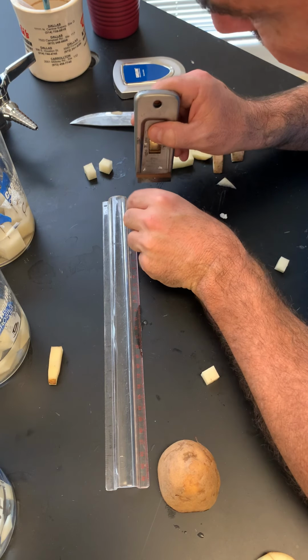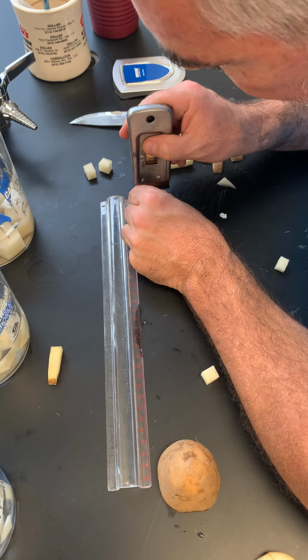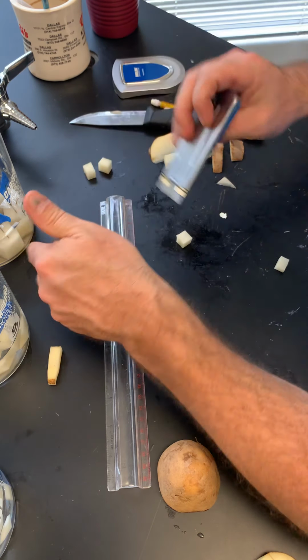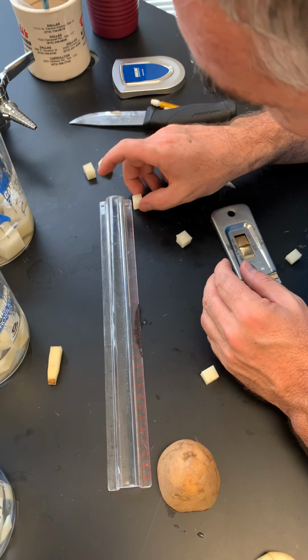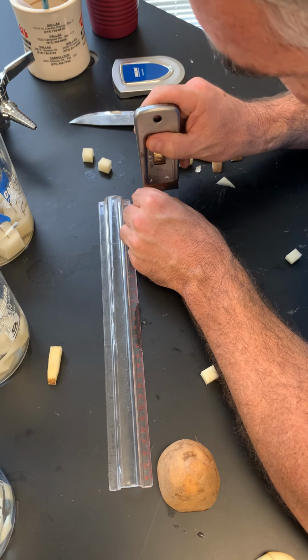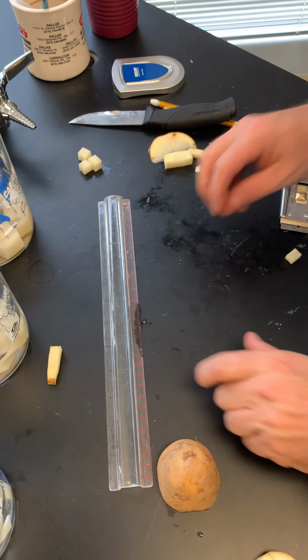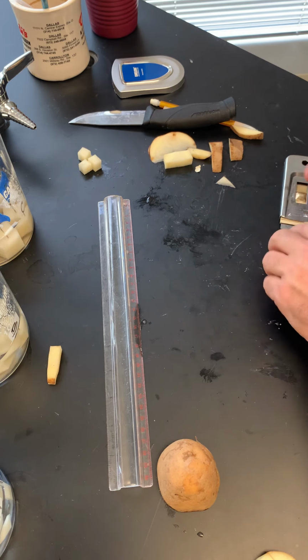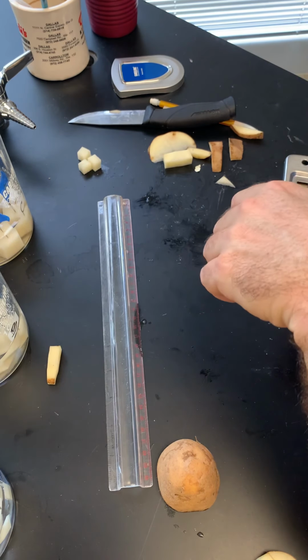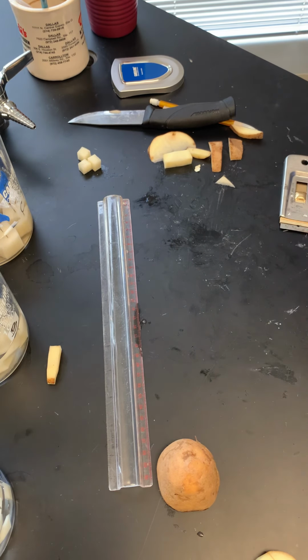This one was a little long, it looked like it was 1.1 or 1.2 centimeters. I could shorten it because it wasn't perfect. Just take a little slice off. So now it's a perfect little cube. And this one's a little longer on one side as well. There you go. The more accurate you are, the better. So cut with precision. What we're going to do is I've got a timer set at 250. I will take these out and see the results and we'll record them, and then I'll show you guys how to analyze them. All right.